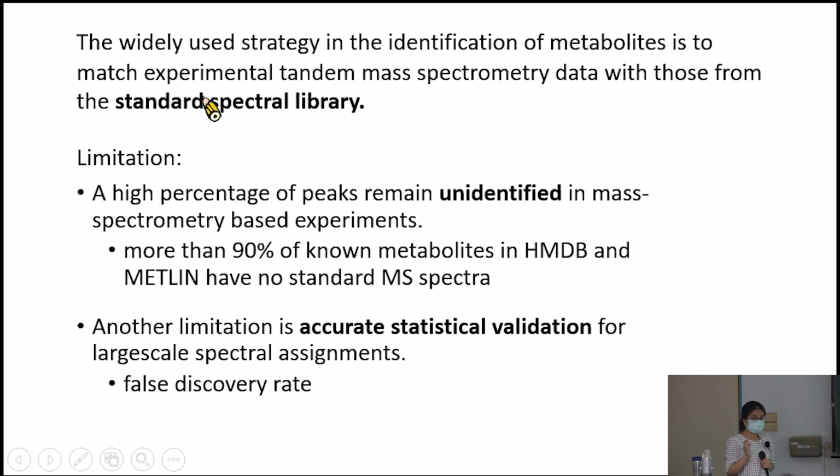Okay, so this is the major point that we need to focus on in each of our mass spectrum data analyses. And although we talk about how this approach can be used for determining unknown metabolites, there are still some points that we need to focus on. The first I would like to talk to you about is the library data. When we get started with this metabolite analysis approach, we usually need to compare our sample with the reference library.